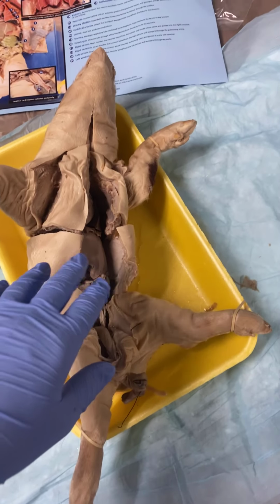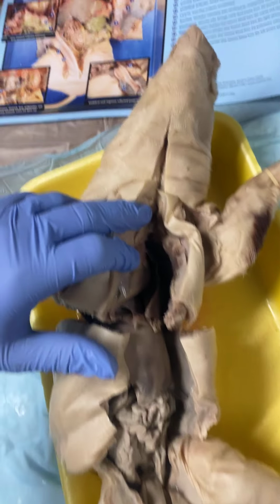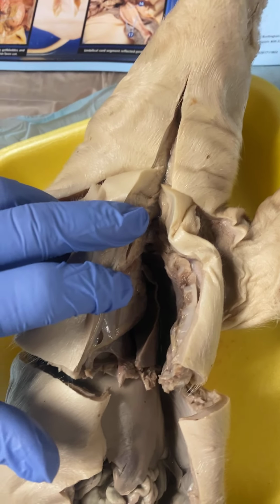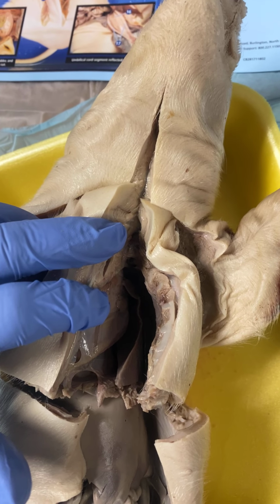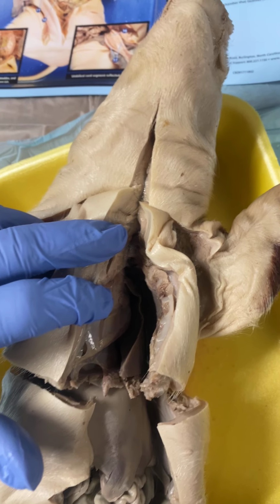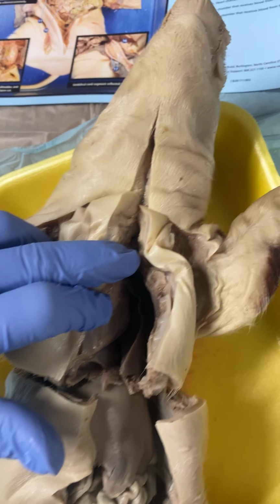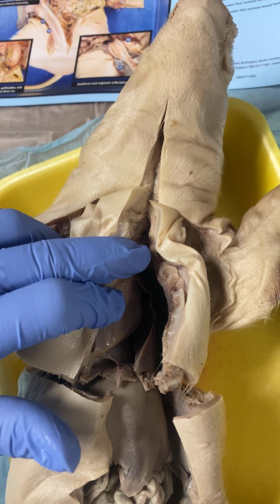Okay, now that I've tied the pig's legs back and opened him up, I can point out some of the structures on the inside. Right in here, where my middle finger is, you have the thyroid gland. And this gland produces hormones important in metabolism, growth rate, calcium levels, and development of the skeleton, muscle, and sex organs. And then right over here next to it, you have the thymus, which is the immune system organ in which T cells mature and differentiate.